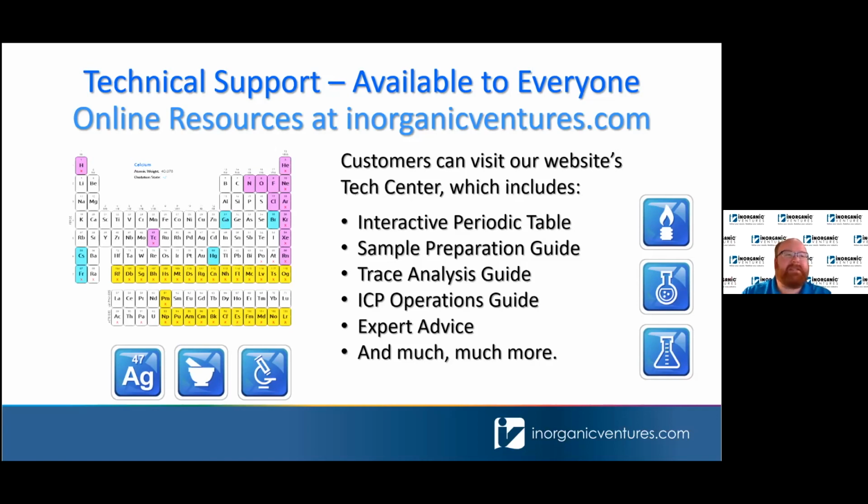But I haven't specifically seen aluminum be a washout problem. However, I have seen it leach out of plastics. So one of the things you might also want to look at is make sure you're leaching your sample tubes and any bottles you're using for sample prep, leach them and rinse them with clean DI water to make sure the aluminum you're seeing might not actually be from your sample containers. So there's multiple places that could be coming from. Great, thank you. A little bit of troubleshooting for that one, it seems.